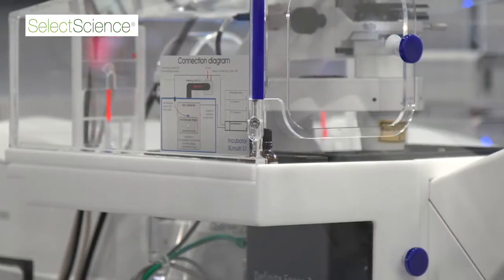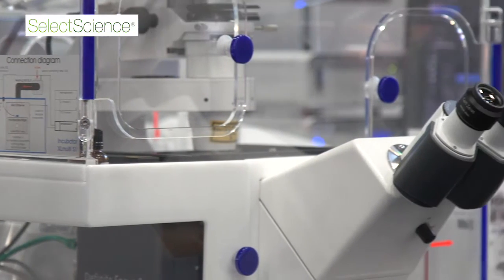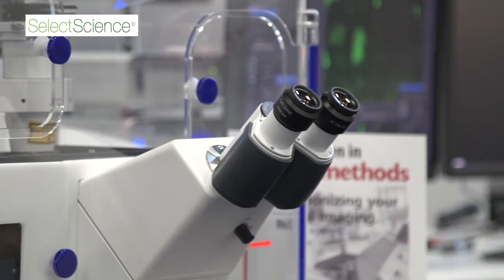The LSM 880 80ScanFAST gives us the best of many imaging modalities. It's a fully spectral confocal for spectral imaging and linear unmixing. The 80ScanFAST gives you the ability to do super-resolution without changing anything about your samples, and to image live dynamic processes at very high temporal resolutions — basically making this instrument the Swiss Army knife of your imaging facility or lab.